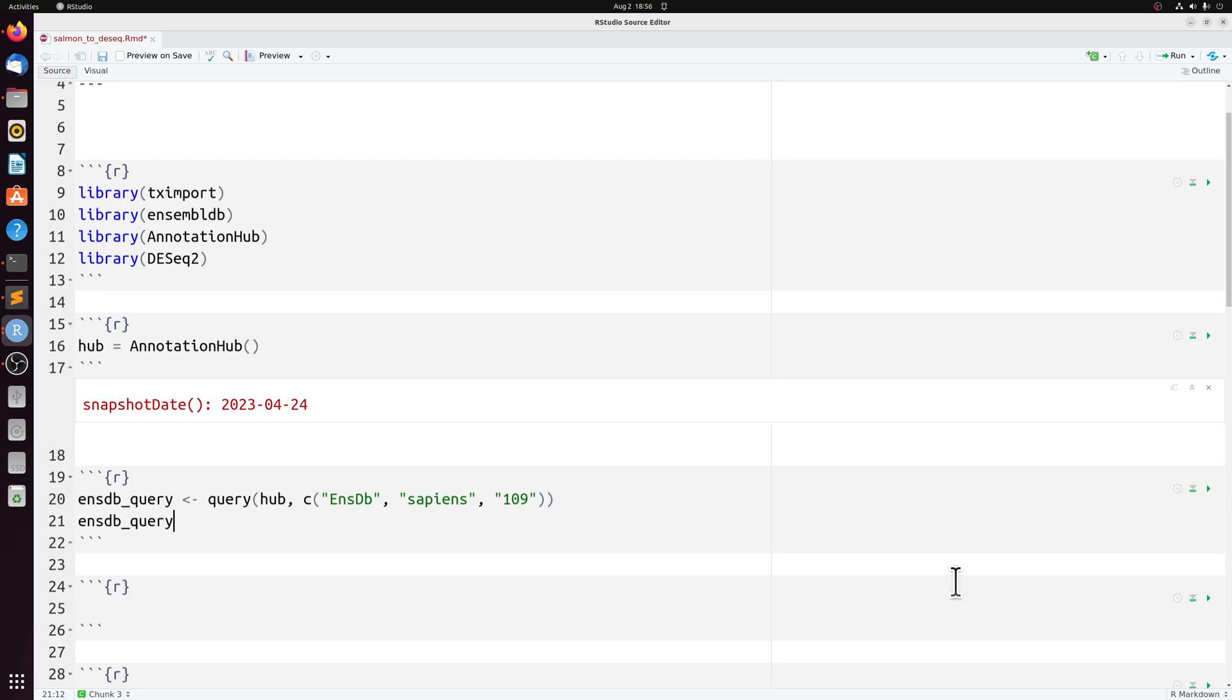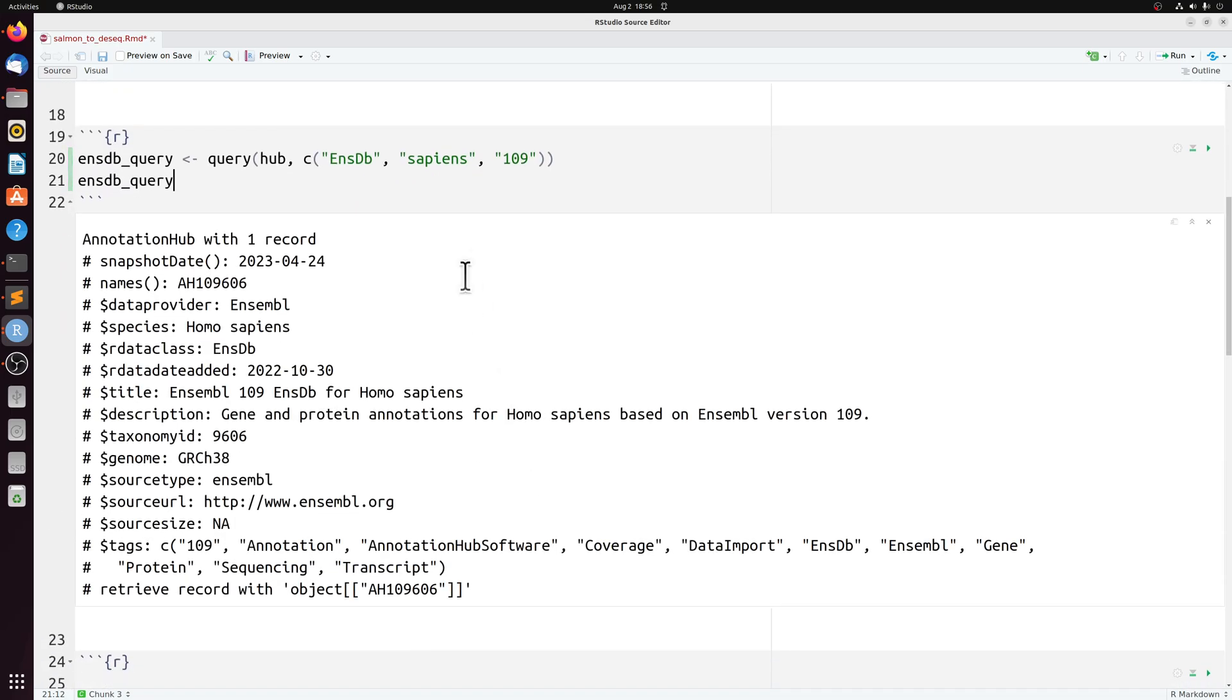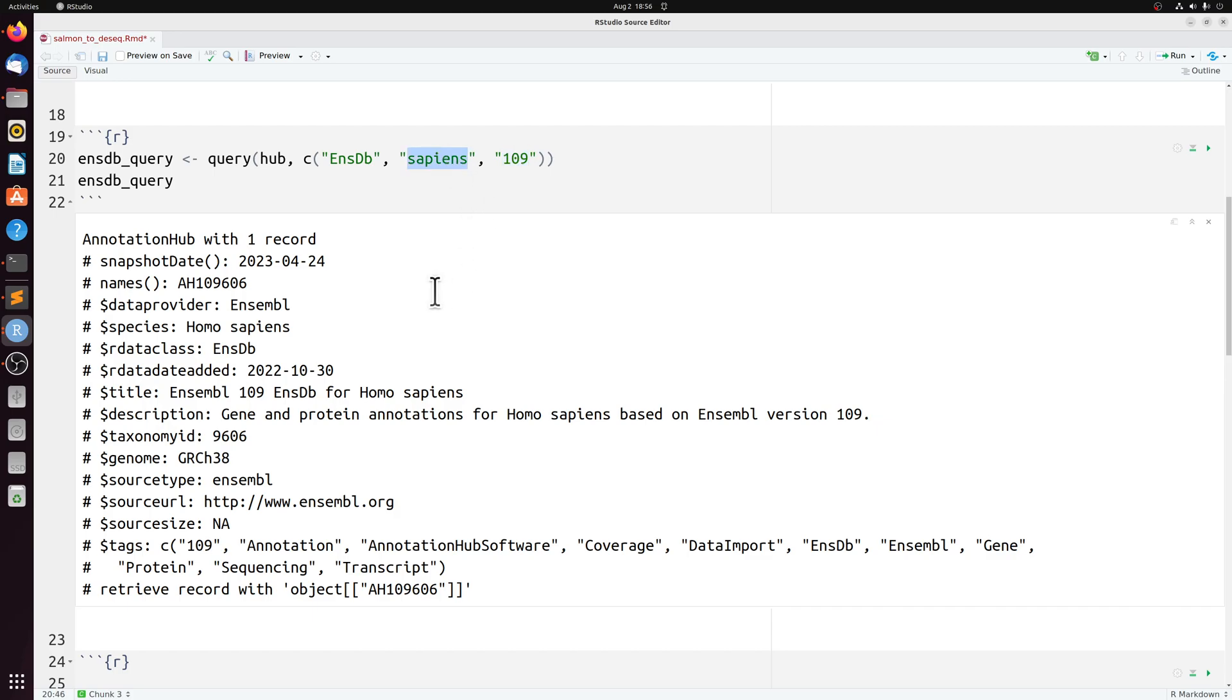We can then query Ensembl. And in this case, I know exactly that I want the EnsemblDb Homo sapiens 109 build. Of course, if you're using mouse, you'll have to replace this with musculus and then the build number.